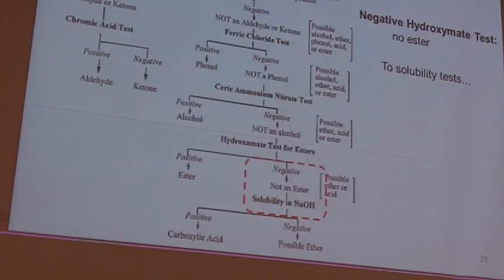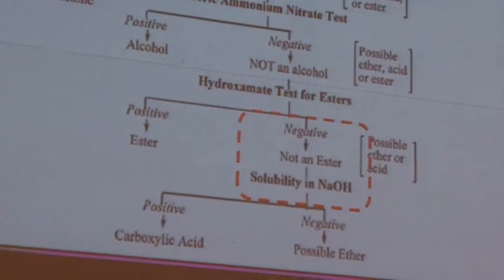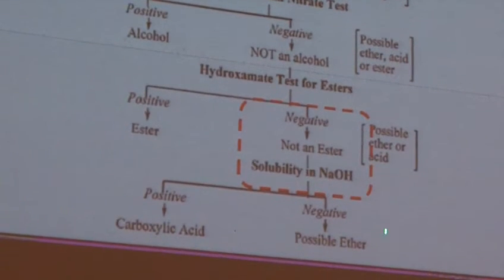We're almost done. Those of you who get this far, you're really going to have to keep it up, because you have to go all the way down to the bottom. A few of you unlucky people will get to do every one of these tests. I promise we don't decide which unknown you pick just because we like you or not. Down here at the bottom, if that one's positive, you have an ester.